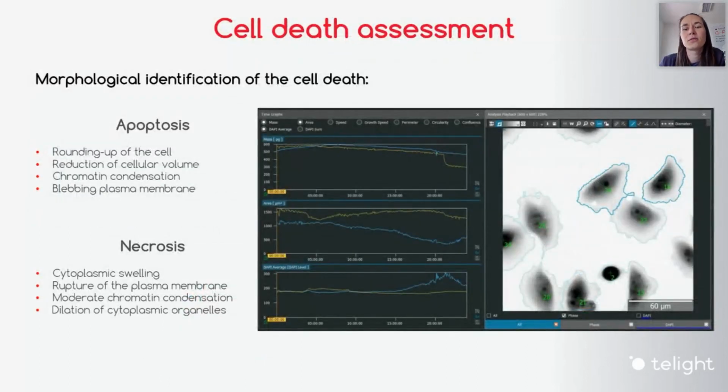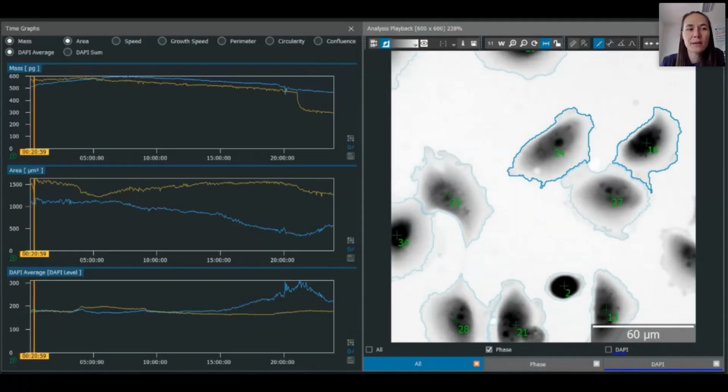You can also use quantitative phase imaging for the studies of cell death. There are several papers already published that use this technology for studies of apoptosis, necrosis, and more types of cell death. So just a brief introduction: apoptosis is the programmed cell death, and necrosis is based on inflammation, for example. It's the situation when the cell ruptures and spills the content out.